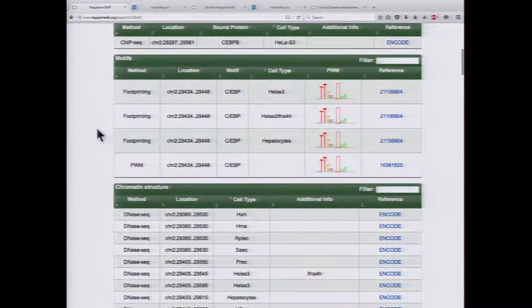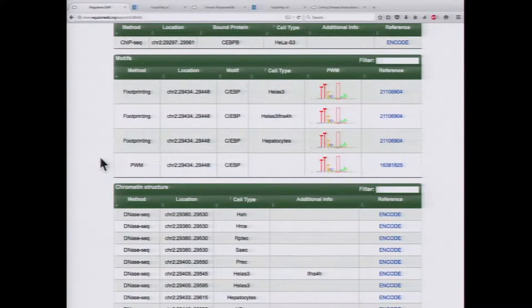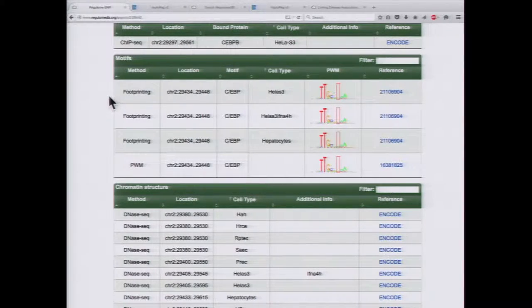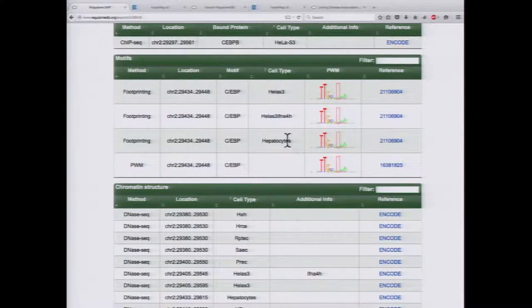Scrolling down, we see there are motifs using two different methods. One is using PWM scores — essentially a matrix giving you the probability for each position, searching the sequence for matches. You also have results from DNA footprinting, where you have the small region actually protected by the protein itself. Here we have DNA footprinting in both HeLa cells and hepatocytes.